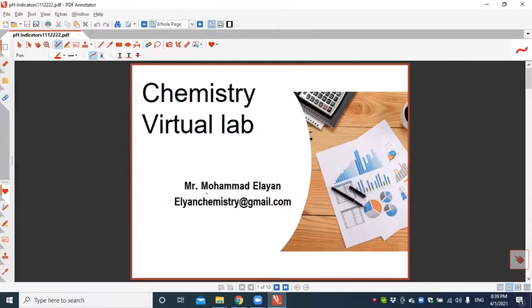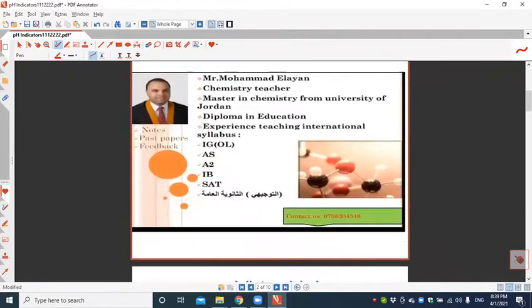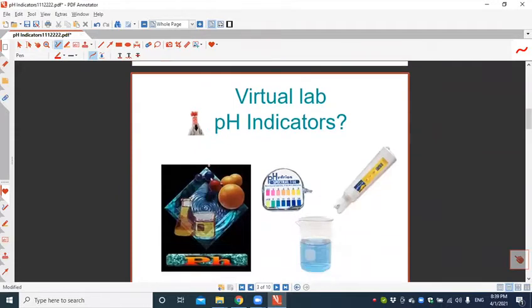I'm a chemistry teacher. Today we're going to explain an experiment in the online lab. It's called a virtual lab. So today we choose the virtual lab on pH indicators.